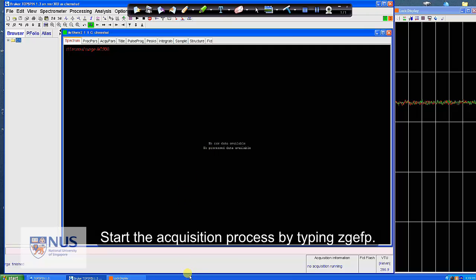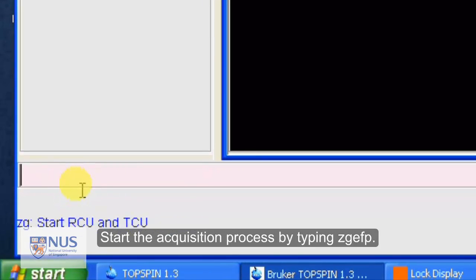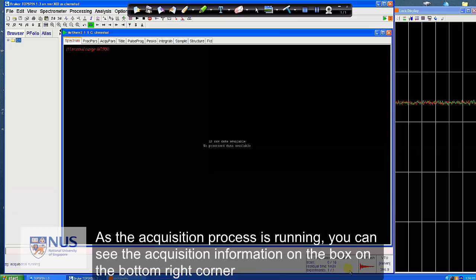Start the acquisition process by typing ZGEFP. Enter. Enter. As the acquisition process is running, you can see the acquisition information on the box on the bottom right corner.